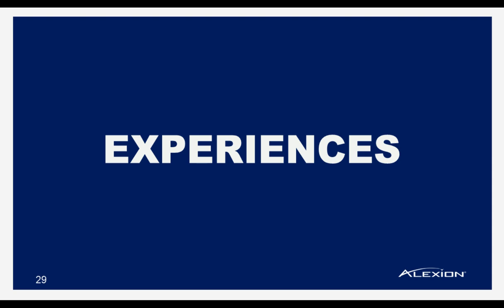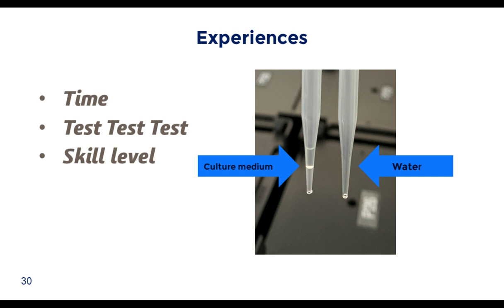Besides the lessons learned mentioned previously, there are broader lessons as well. Implementing an automated workflow requires not only the obvious capital investment, but also a significant time investment. Even without workflow changes, translation of the manual workflow to automation requires significant programming time with repeated testing of methods. As discussed, changing or adding vessels requires testing and optimizing with your cell lines and the automation system. Optimizing just the aspiration of a single culture step could take days of testing.